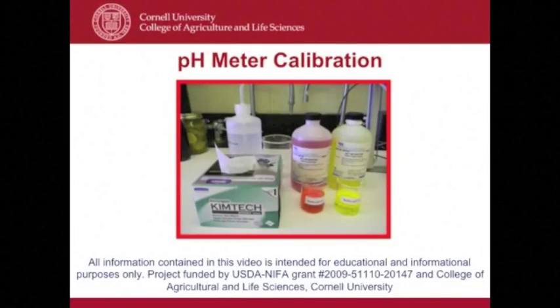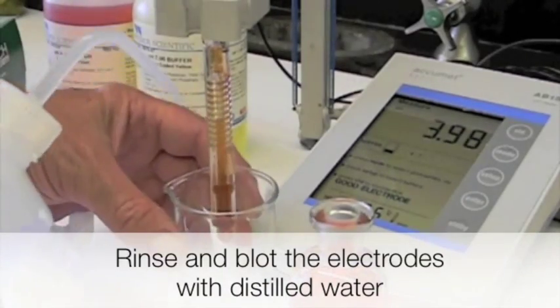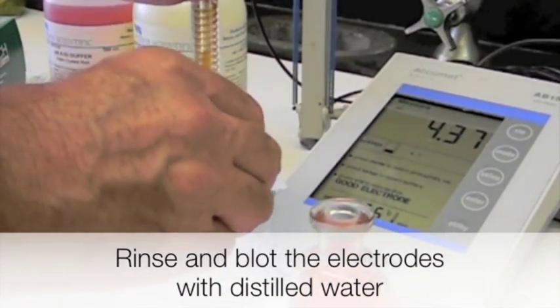This educational video demonstrates how to calibrate a pH meter using two buffers to comply with FDA acidified food regulations. Always follow the manufacturer's instructions for each meter.